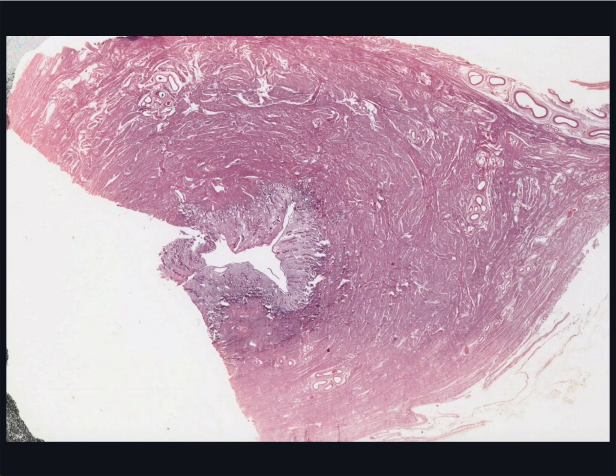This section I'm showing you cuts through just over a half of the uterus. It's not the greatest section in terms of preservation, and there is a bit of tissue shrinkage which distorts some of the histology. But nevertheless, I think it's also quite useful just to point out the basic fundamental histological characteristics of the uterus. First, have a look at the limits of the myometrium and the endometrium.